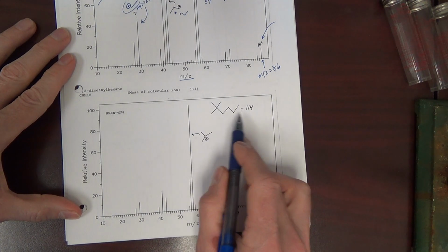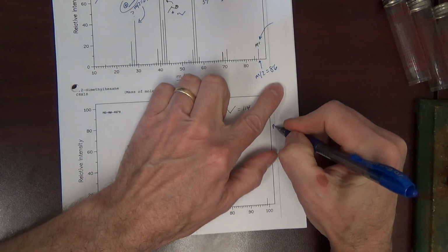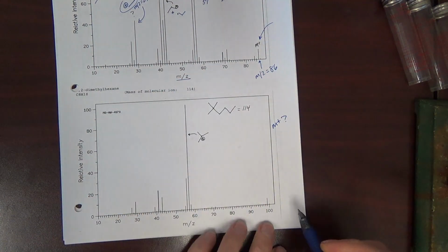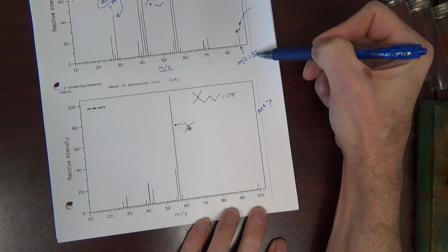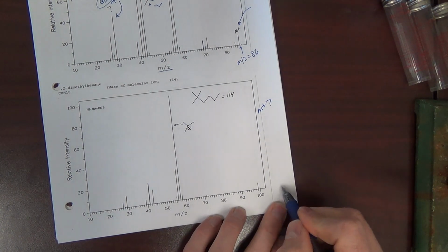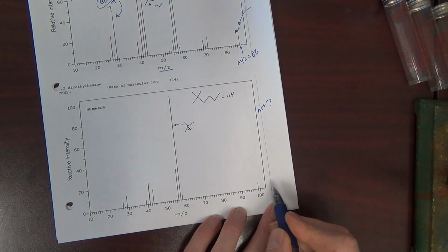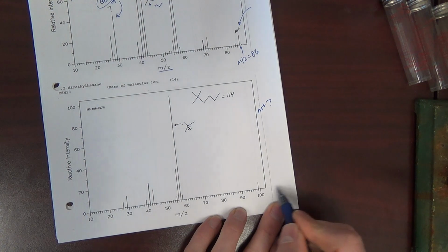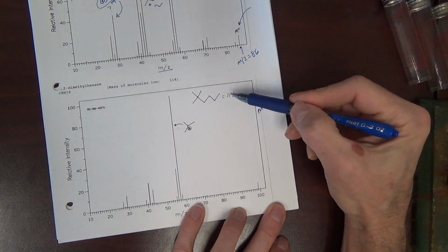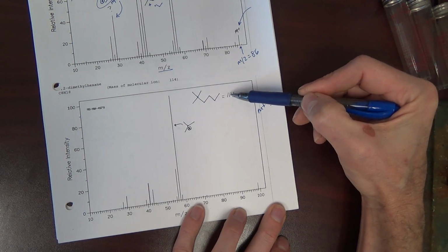This alkane has a nominal mass of 114. Do we have a molecular ion? Up here we had a molecular ion of 86. Do we have a molecular ion here? Apparently not. If so, whoever created this mass spec would not have cut off the 114 portion of the x-axis. So apparently there was nothing there. No molecular ion, meaning apparently once this thing became a radical cation, it did not survive long enough to hit the detector as an entire or intact molecule.